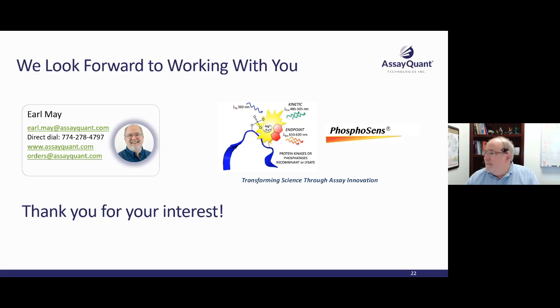We talked a lot about our continuous assays and kinome profiling, but can you talk a little bit about whether you can use the europium endpoint assays for phosphatase reactions?